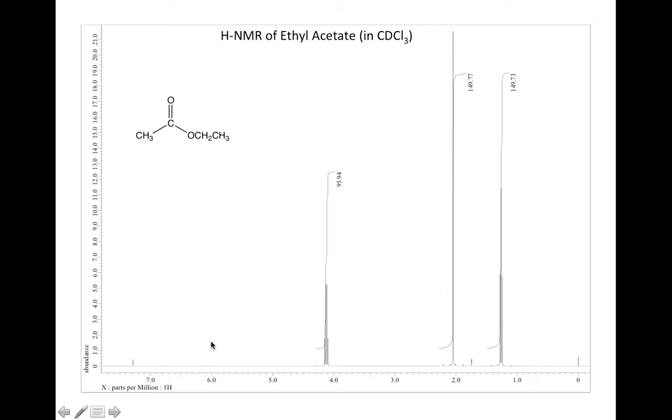Now you're most commonly going to see spectra that are acquired in deuterochloroform, which is just chloroform with a deuterium put in. If that was regular chloroform, you'd have a huge signal from that proton, which would swamp out things. Although you could get a decent spectrum that way, oftentimes people use deuterochloroform. When you buy the deuterochloroform, however, it's not pure deuterochloroform.